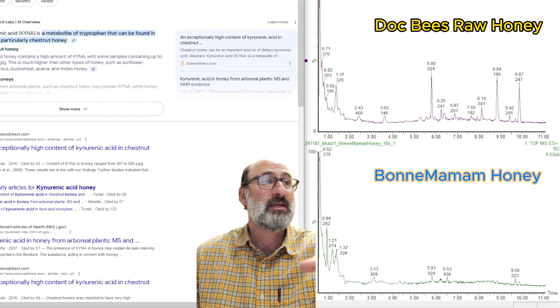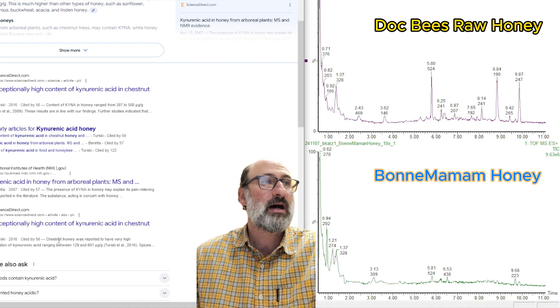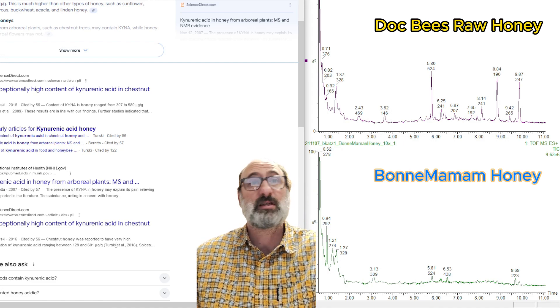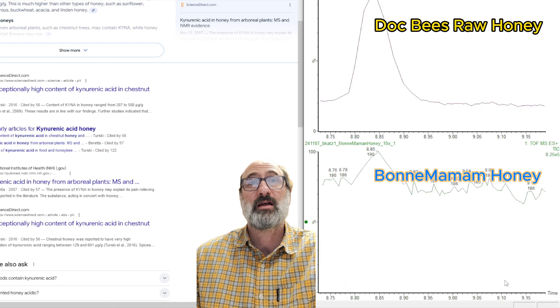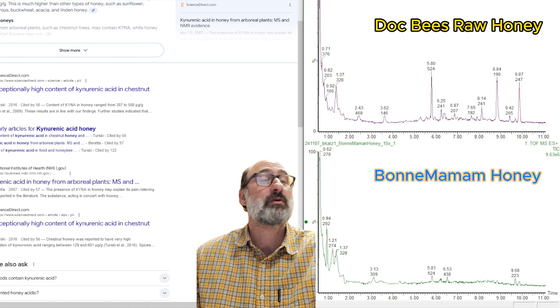KYNA — as they call it — has pain-relieving effects, and some people want really high-KYNA honey. There appears to be a lot of KYNA in the Dockbeez natural raw honey, and there's almost none — a very small amount, if we zoom in — in the Bonne Maman honey. So that's the first significant finding.